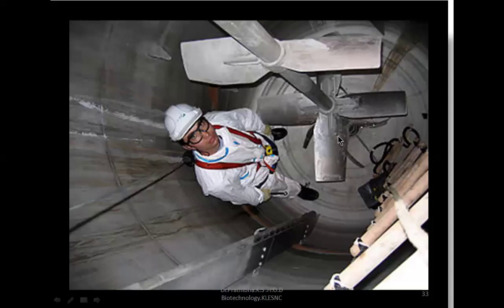As you can see here, this is the big bioreactor vessel where a man has gone inside to check or verify something through this temporary ladder. And these are the baffles. This is the baffles, this is the impeller and this is the central shaft. I hope you understood this particular position of the baffles.